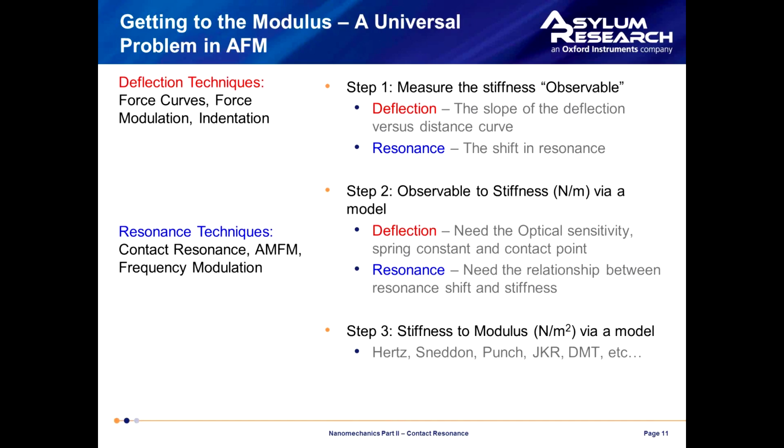The third point is that resonance techniques provide, and I mentioned this before, a pathway to also making dissipation and loss measurements, so loss moduli measurements, for example. That is much less obvious in deflection techniques. In the next slide, Donna Hurley will introduce you to contact resonance measurements.